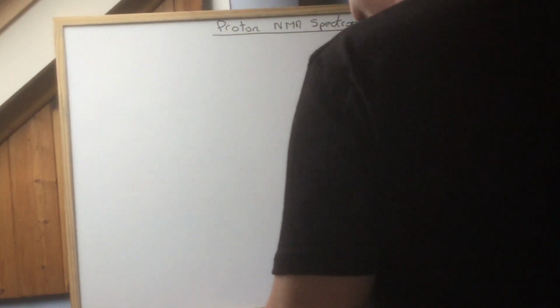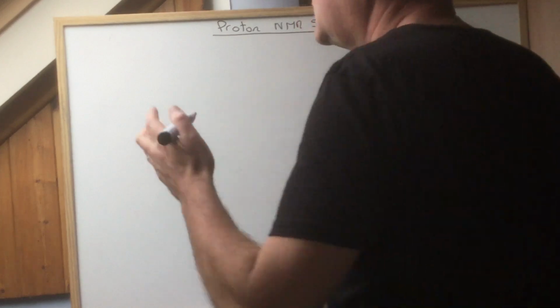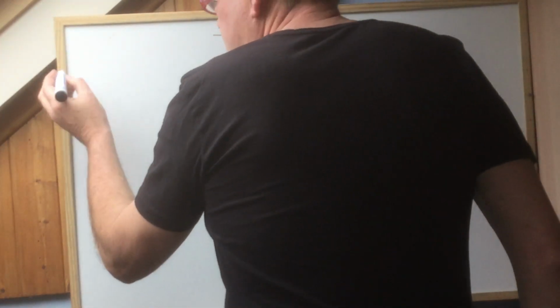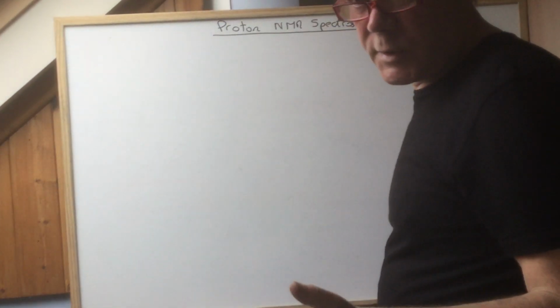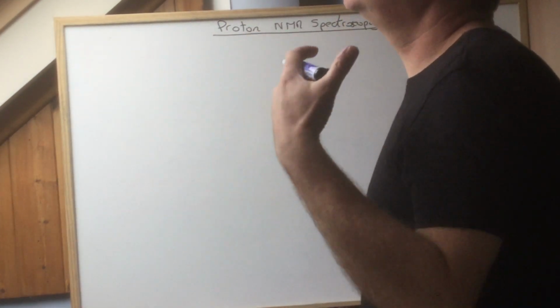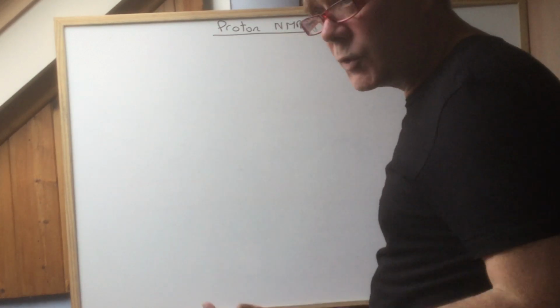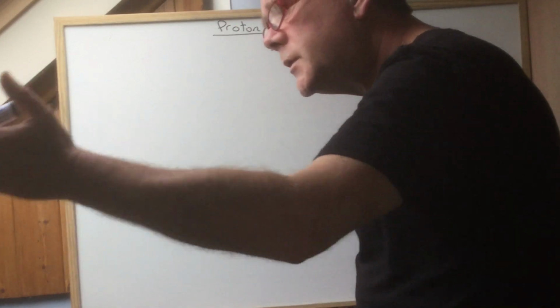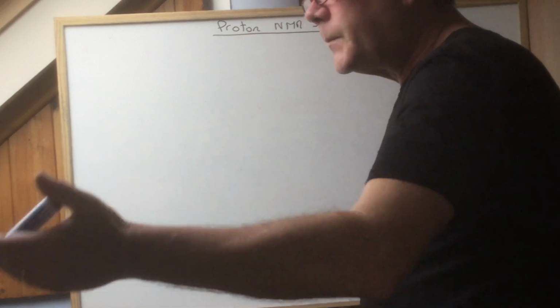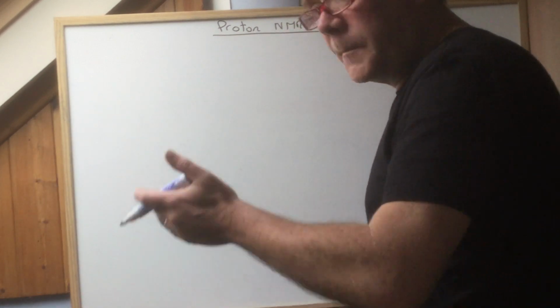Proton. Right, okay. This idea of proton. I don't know why they call it proton. People who are cleverer than me will be able to say that. What it's detecting is, they call them protons, they're hydrogens. So carbon-13, which you will see that there are links to, particularly in terms of the chemical shift in the environment and the idea of equivalence. It takes carbon-13 much further forward than that. But that's a good starting point for basic principles.